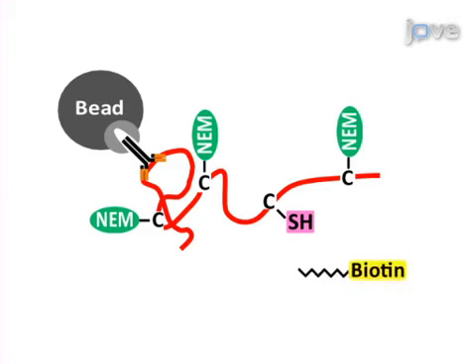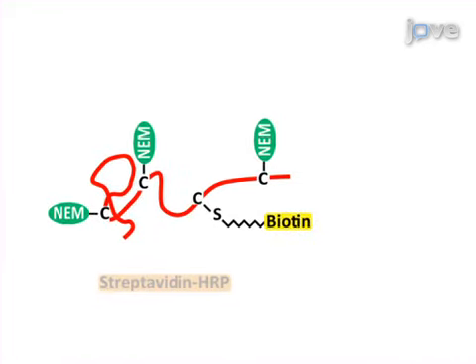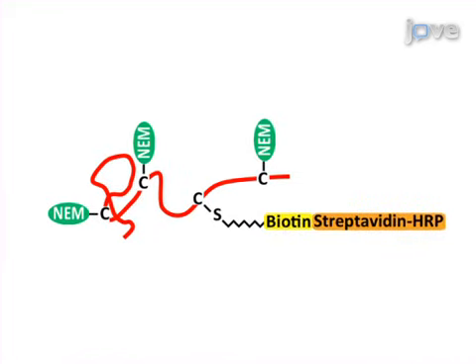In the third step, the immobilized target protein is incubated with biotin BMCC, a thiol-specific molecule tagged with biotin. This biotinylates and tags the thiol group that was originally palmitoylated. The final step is to detect the level of palmitoylation of the target protein by SDS-PAGE and Western blotting for streptavidin.